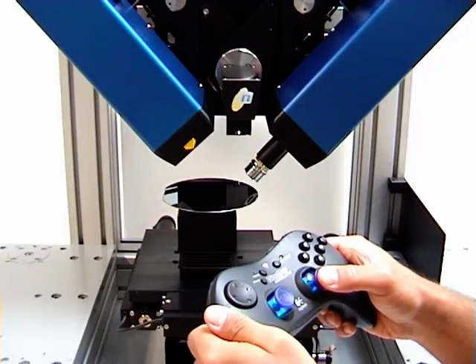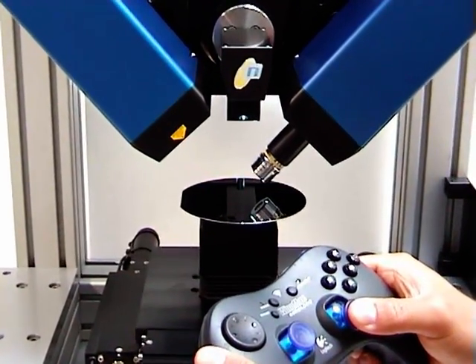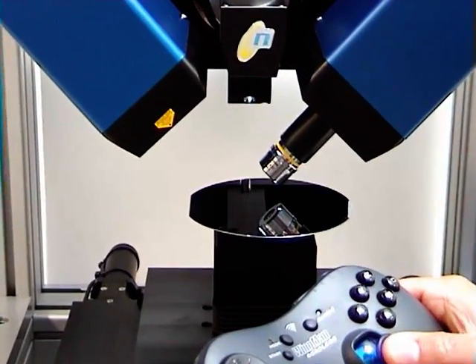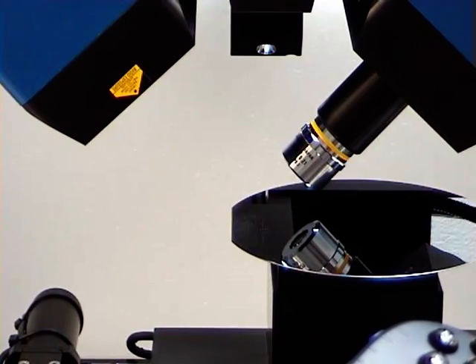The automatic stage has 5 degrees of freedom, namely X, Y, Z and 2 alignment axes, 1 micron accuracy and is easily operated with this wireless joystick.